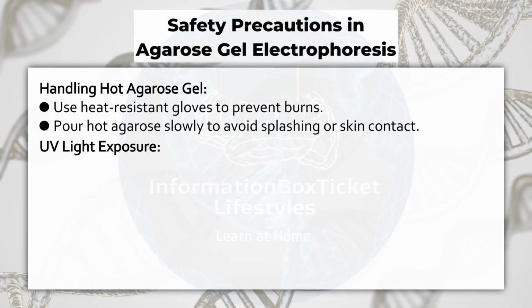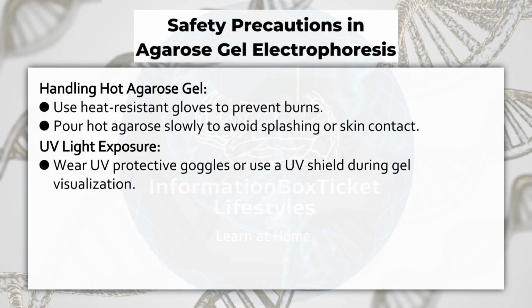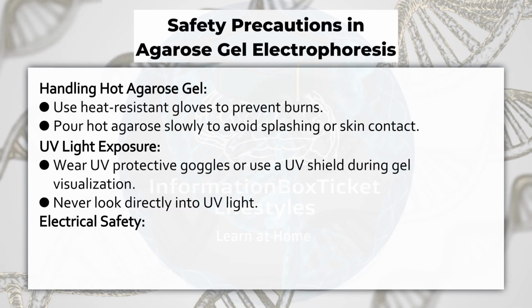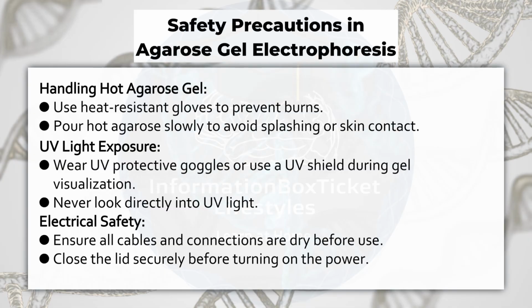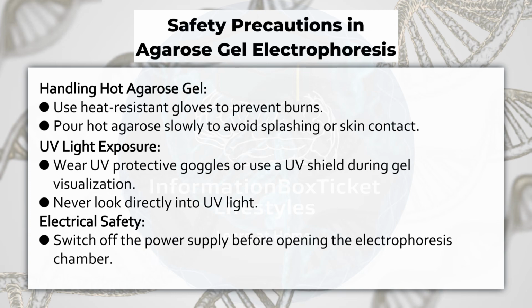UV light exposure. Wear UV protective goggles or use a UV shield during gel visualization. Never look directly into UV light. Electrical safety. Ensure all cables and connections are dry before use. Close the lid securely before turning on the power. Switch off the power supply before opening the electrophoresis chamber.